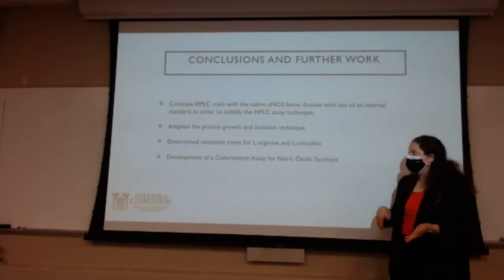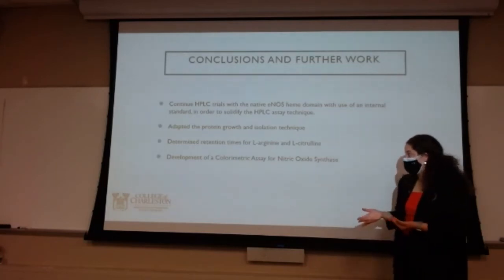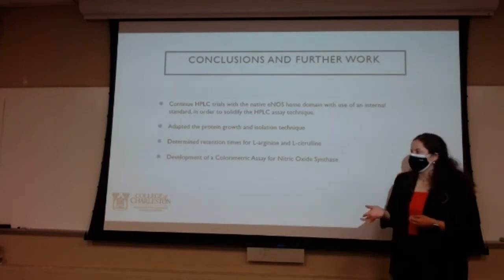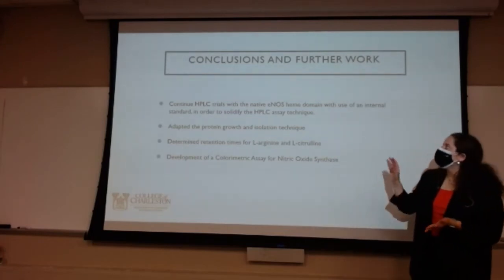And then going forward, we're also working on the development of a colorimetric assay for nitric oxide synthase with a new device, which is super interesting. Something I'm getting to stay over the summer to work on a little bit more, thanks to Embry.